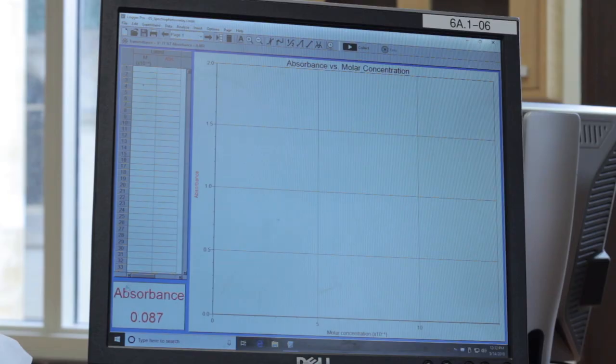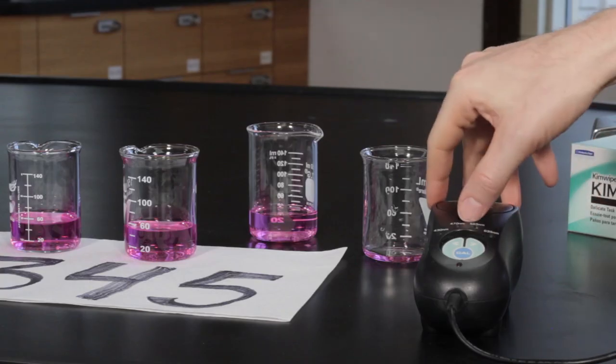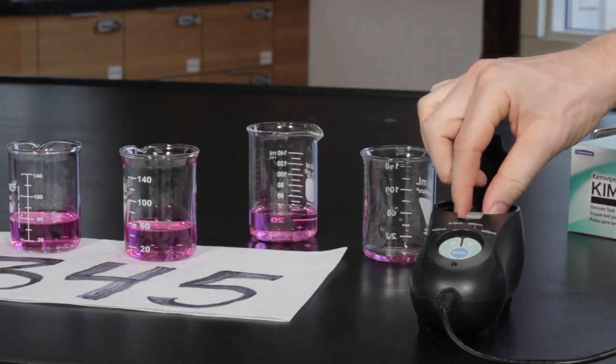Follow the instructions in your lab manual to collect the absorbance measurements in LoggerPro for solution 5. Remove the cuvette from the cell wall and discard its contents.